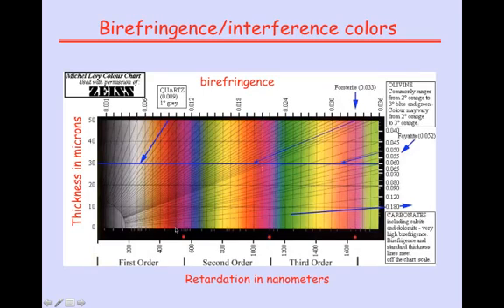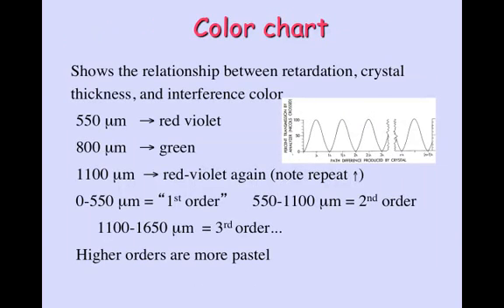You need to remember that a common mistake is to look at the retardation, to look at the color, let's say first order red, to come up here and simply keep going straight and reading the value for birefringence off the axis. That's incorrect. What you need to do is find the color, look at a thickness of 30 microns, and then follow the radial line up to the axis for birefringence. That's the value that you need, and that's correct.